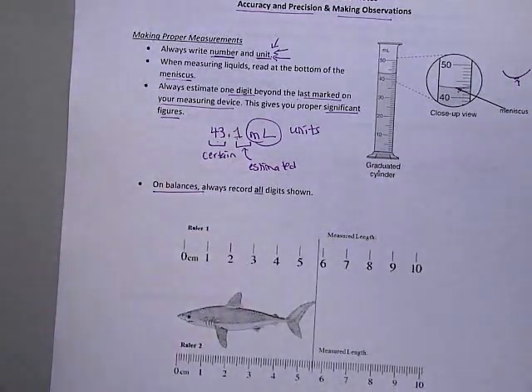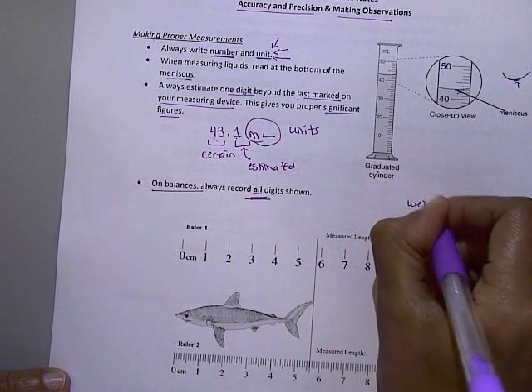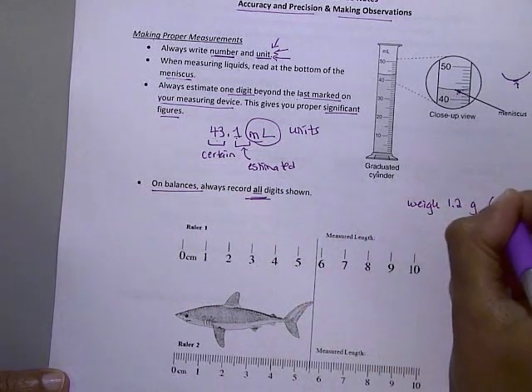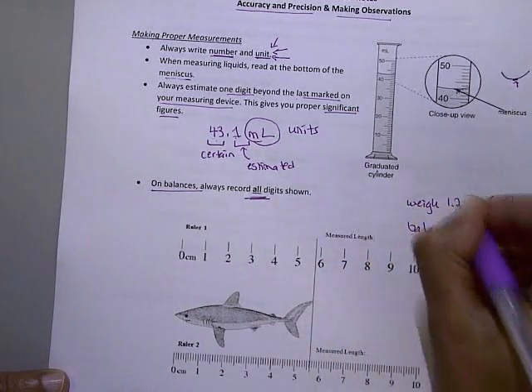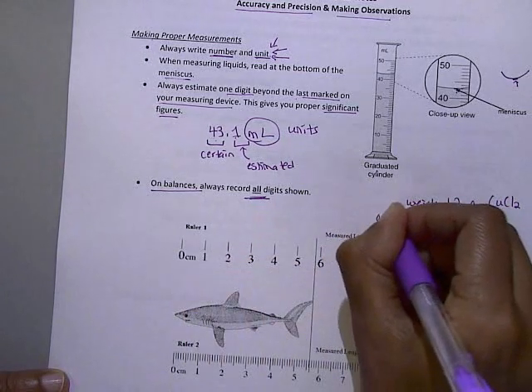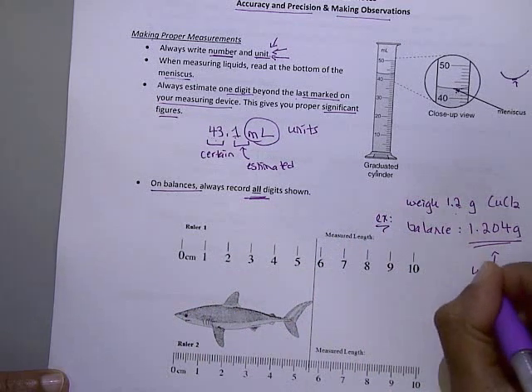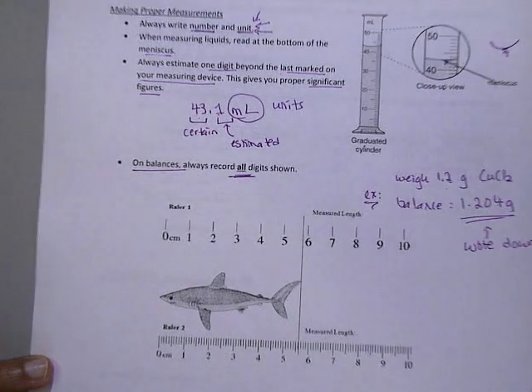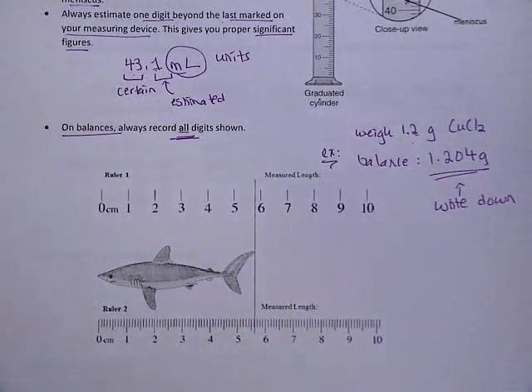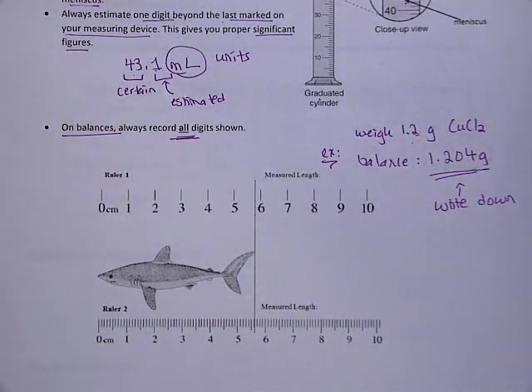On balances in lab, you have to record all digits shown. Meaning if your lab manual says, for example, weigh 1.2 grams of copper chloride, your balance is actually going to show beyond this 1.2. So your balance, for example, might show 1.204 grams. This is the number that you write down. You don't write 1.2. No balances used in our chemistry lab read only to 1.2, so you have to write down all the digits shown in your balance.